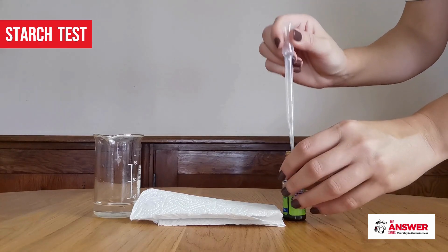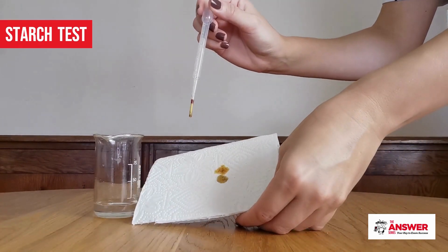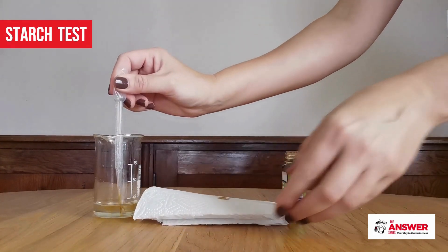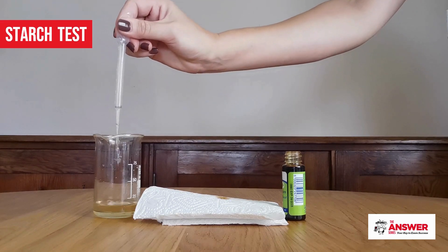A precaution to note is that iodine stains and can also be an irritant when it comes into contact with skin, so be sure not to spill any of it and clean any apparatus that comes into contact with it quickly.